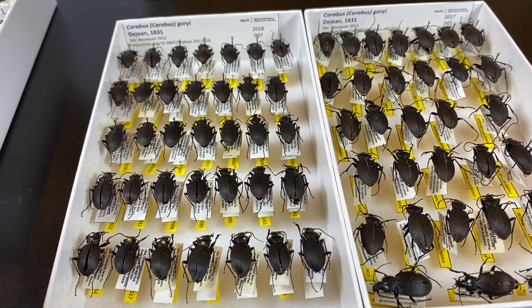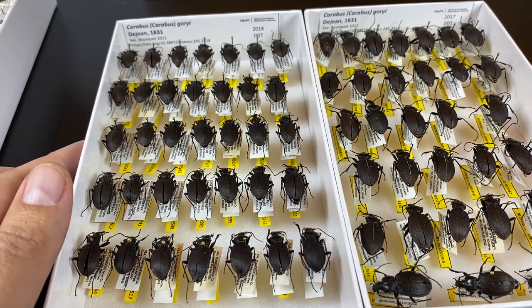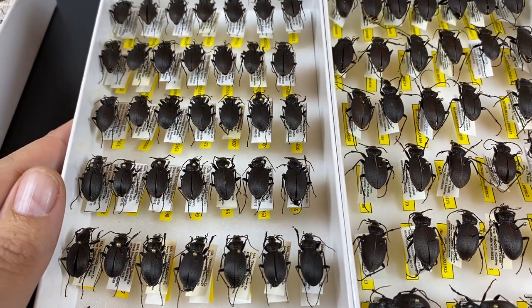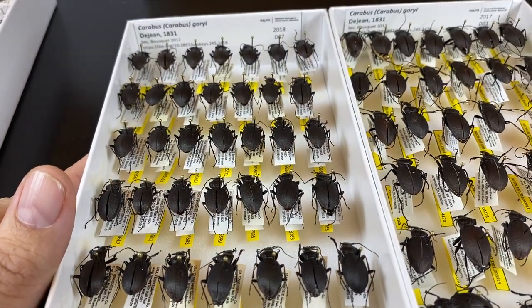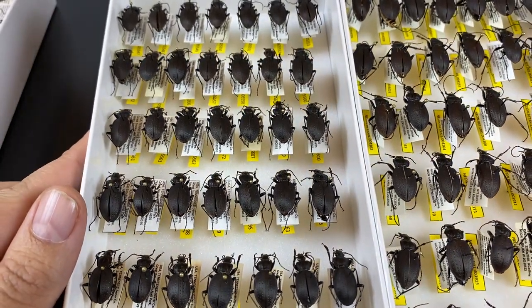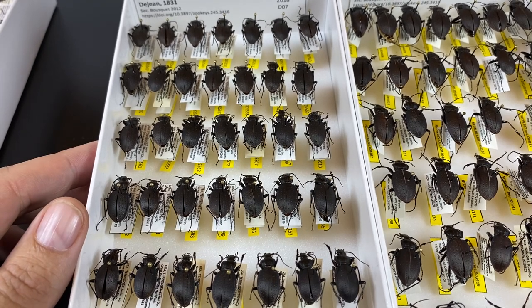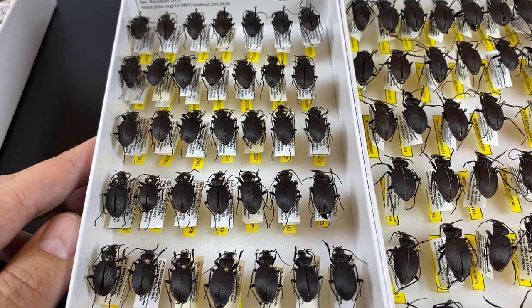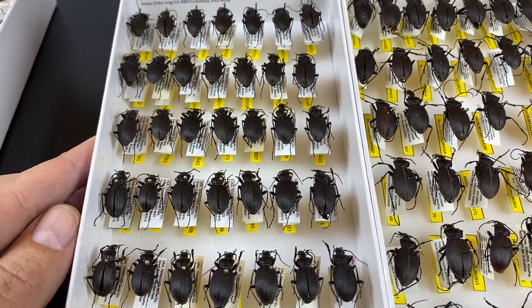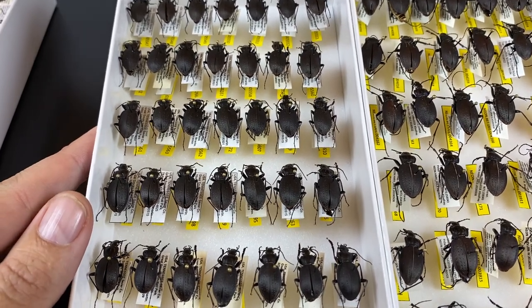In this video, I want to talk about putting specimens into a scientific research collection. These are two unit trays of pinned carabids of the species Carabus goryi from the NEON Biorepository insect collection. I wanted to talk today about three ways we can think about specimens in collections: preservation, practicality, and presentation.